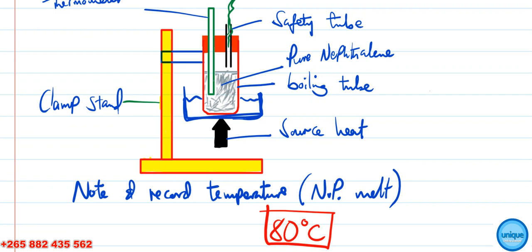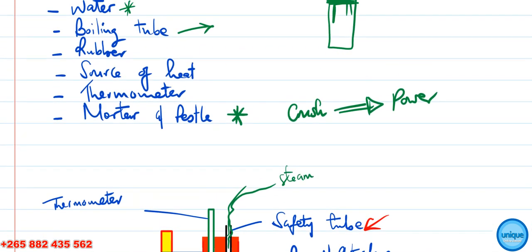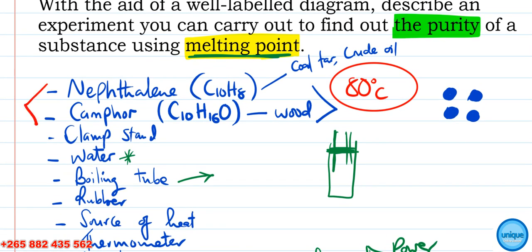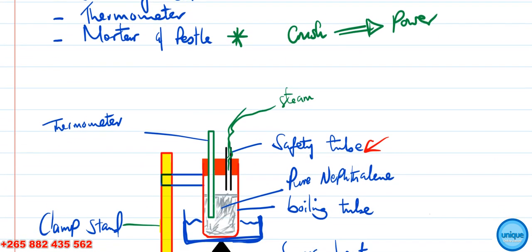Next, clean your test tube, thermometer, and safety tube with distilled water. Then take the naphthalene and add camphor to it — the camphor is added to make the naphthalene impure. Repeat the same procedures as you did with the pure naphthalene.